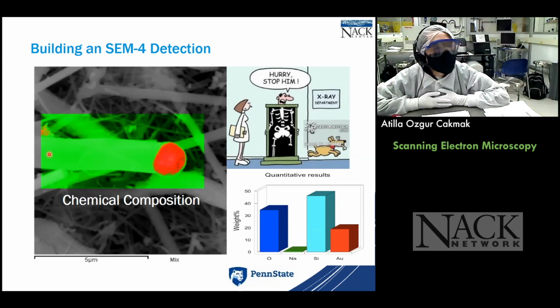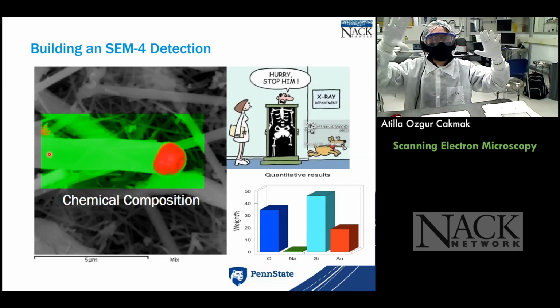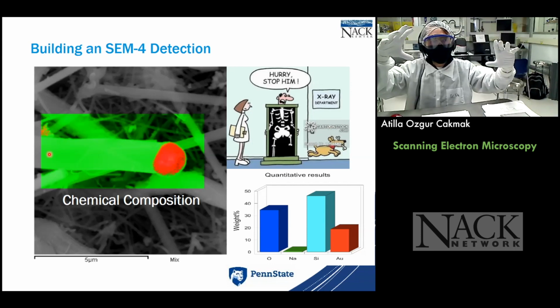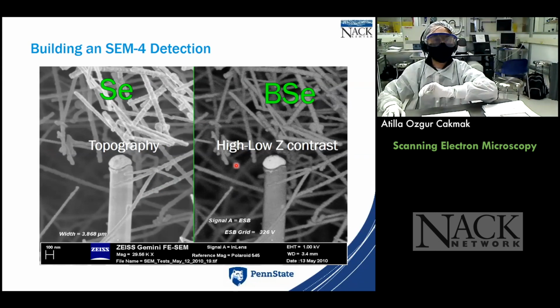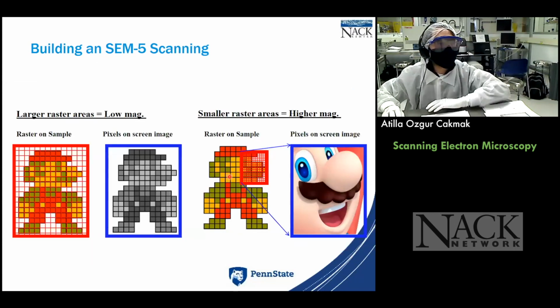There's a question. So the backscattered and the secondary electrons are collected, and the pixel represents a combination of both number and energy? Yes, yes. It depends on which detectors are used, okay? You don't detect them with the same detector. There's a backscattered electron detection mechanism, and there's a secondary electron detection mechanism. Each one will tell us information about both, but yes, you can put these together with your electron microscope software to compare and understand more about your surface in terms of topography and other information too.